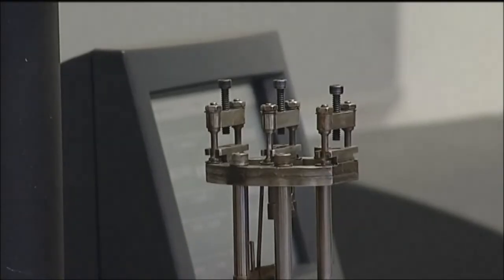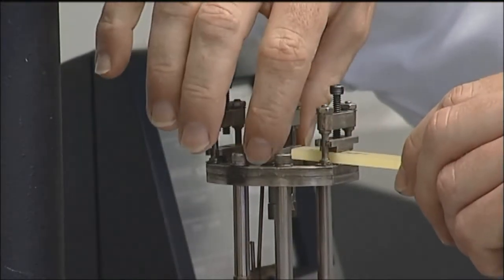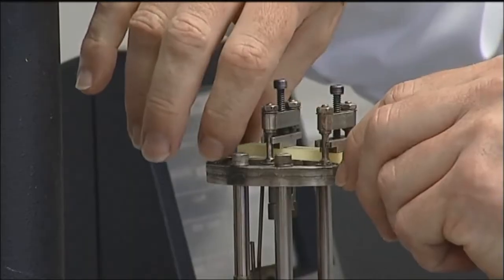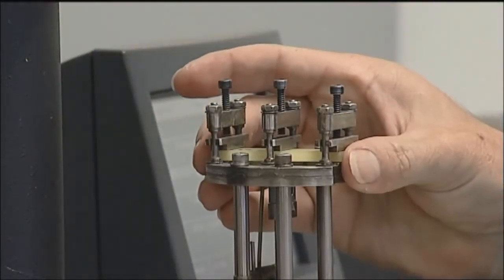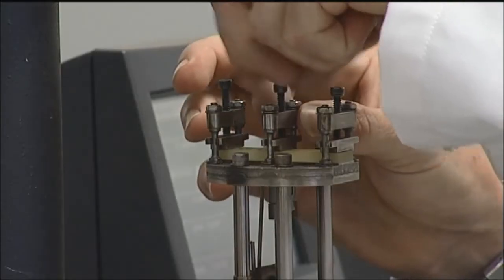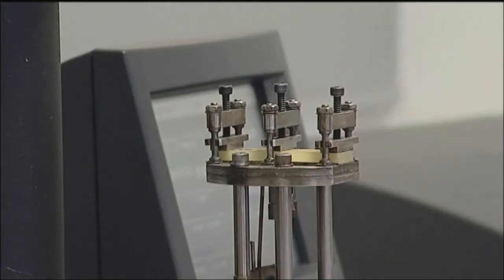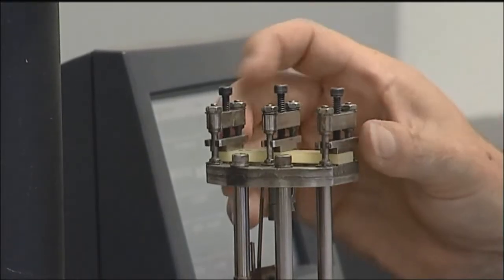Now we need to mount the sample inside the dual cantilever in the DMA instrument. We just put the sample inside and tighten up the screws of the dual cantilever. And use this special screwdriver to tighten it up.